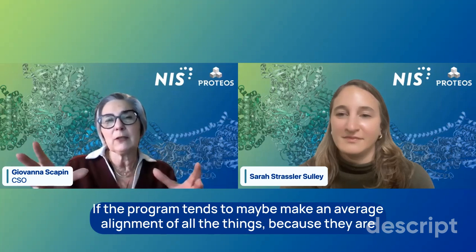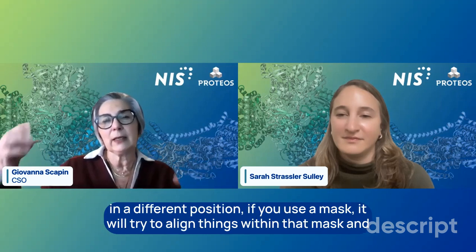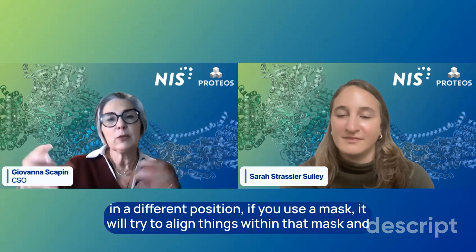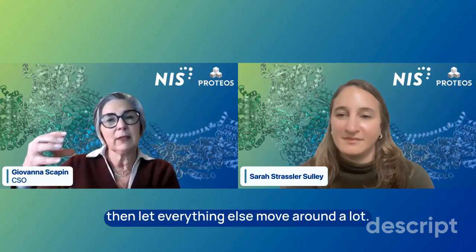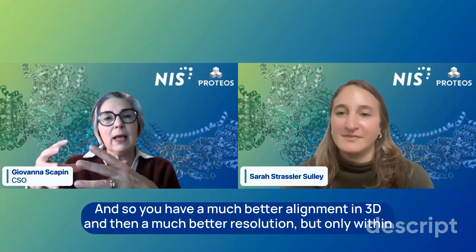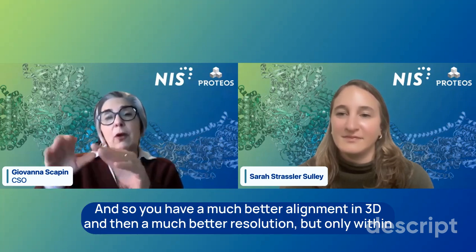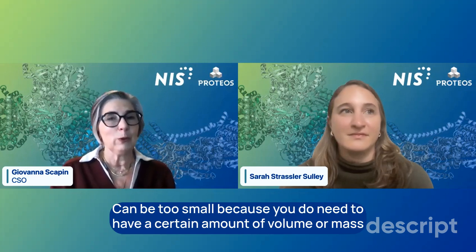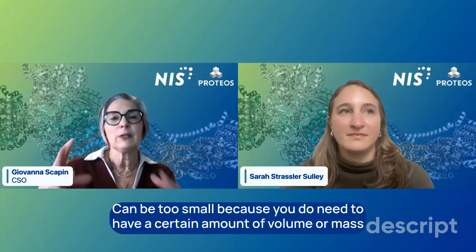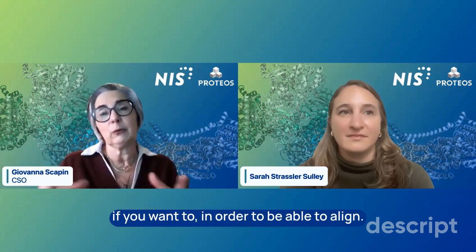If the program tends to make an average alignment of all the things because they are in a different position, if you use a mask, it will try to align things within that mask and let everything else move around a lot. And so you have a much better alignment in 3D and then a much better resolution, but only within that specific envelope that you are defining. It can be too small because you do need to have a certain amount of volume or mass, if you want, in order to be able to align.